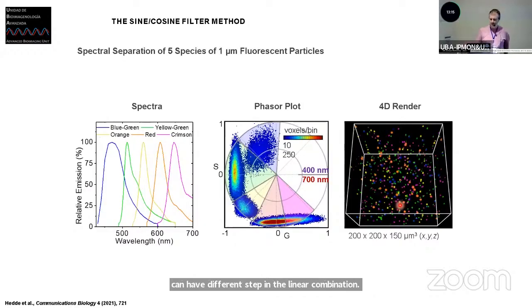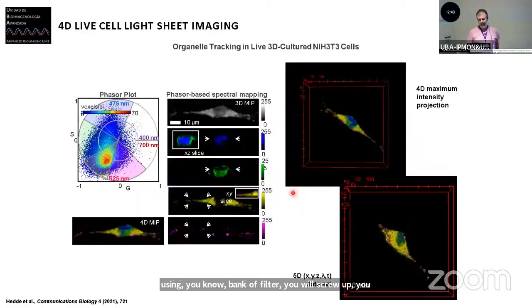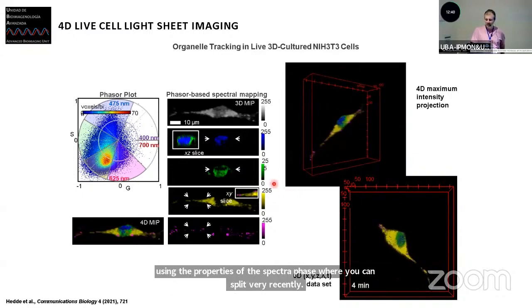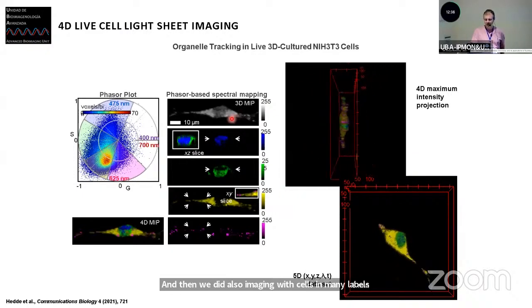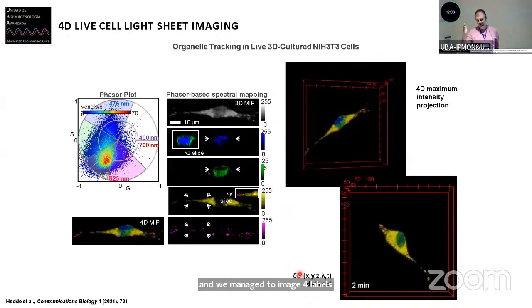So then we played around with some examples. Usually we start with beads, and this is a 3D stack of hyperspectral information of five different spectral species of fluorescent beads at 1 micrometer. And you can see that the spectra are very overlapping with each other. If you want to do this using bandpass filters, you will screw up. You will have bleeding of one into another, but using the properties of the spectral phasor, you can split them very decently. And then we also did imaging with cells with many labels, and we managed to image four labels in a 5D stack, so X, Y, and Z, lambda and time.